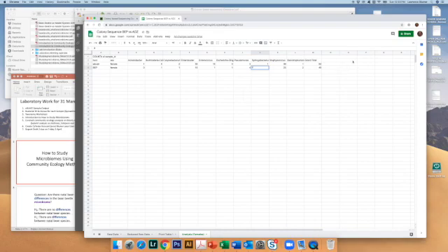So the first thing we want to know is how many different genera were present in each of these categories. In other words, how many different genera were present in the bacteria that were collected from females that were raised on Adzuki beans, and how many different genera were found in bacteria collected from females that were from black-eyed peas. These grand totals are not the number of genera. These are the number of samples. So the number of genera would be the richness. So I'm going to type that in this column.